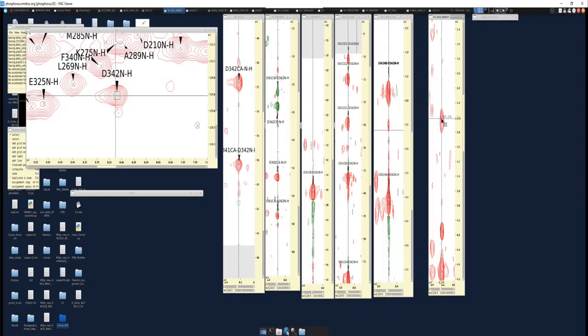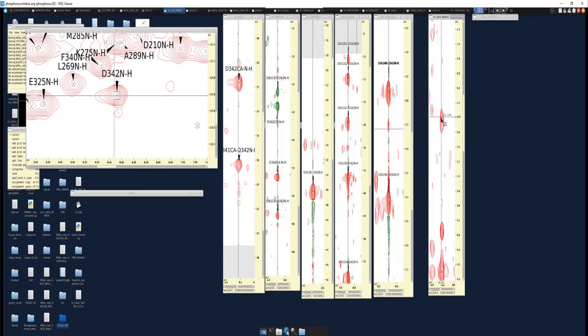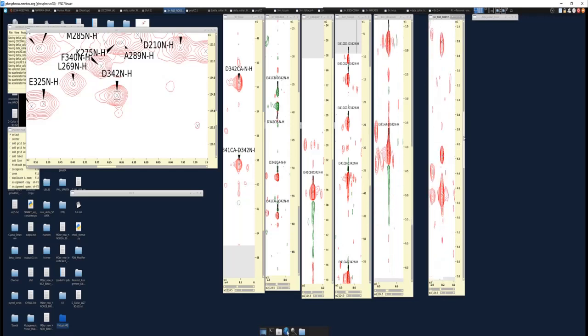For example, here you have another H beta at 2.6. This is clearly not the H beta of the I-1. In fact, in the NOESY, maybe it's that small noise, but you don't really have a peak for the H beta for the I-1. So this might be the H beta for your I peak. Again, it's not a guarantee. It all has to do with how far things are from one another and a variety of other factors of whether or not they will show up.